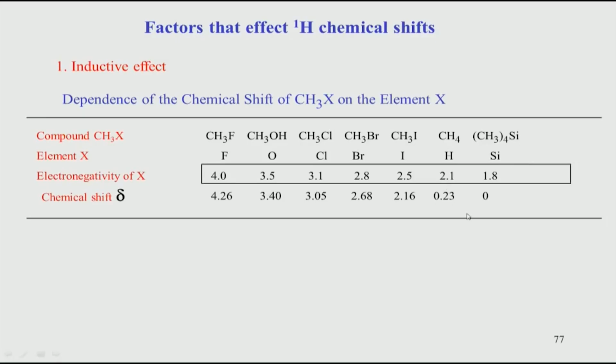And we also saw in the previous class that the chemical shift value does not depend on the spectrometer frequency when you measure in the ppm scale. So, chemical shift in ppm scale does not change. If I say it is 0.23 ppm for CH4 methane, it will be the same in every spectrometer, whether it is 300 megahertz, 600 or 900. This value does not change, the reason being we always set the frequency reference as 0 ppm, so everything with respect to that remains constant. That is the idea we discussed in the last class, and this will come up again later on.